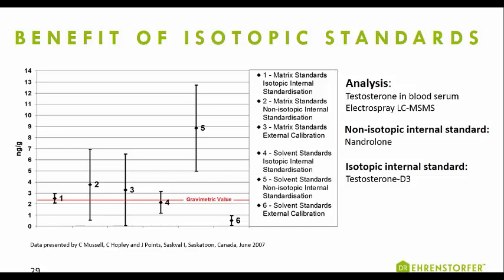You can see on set 5 the LCMS matrix effects you can get from using a conventional internal standard. But at least in this case, the wide spread of results would give an indication that something was wrong. More concerning is set 6. The matrix effect bias is incredibly consistent. If you did not know the true value, then you would assume that you had a very good and accurate set of results. It's only when using the isotopic internal standard, sets 1 and 4, that we get both precision and accuracy.